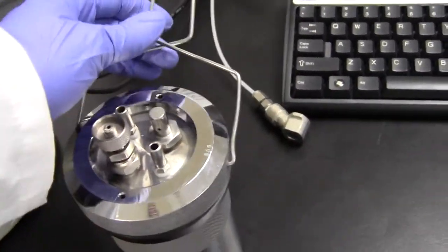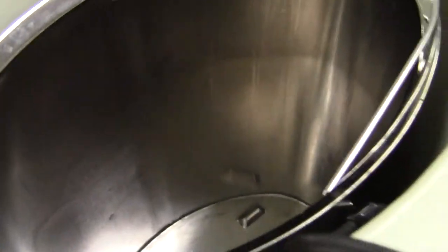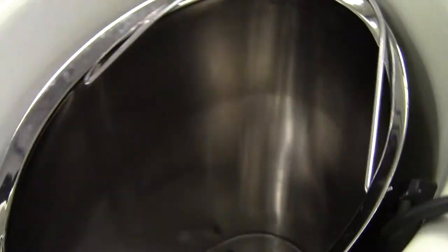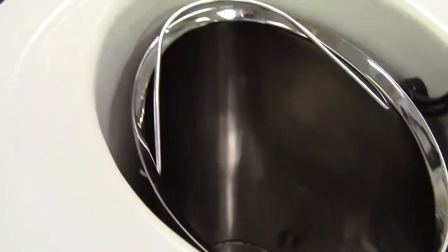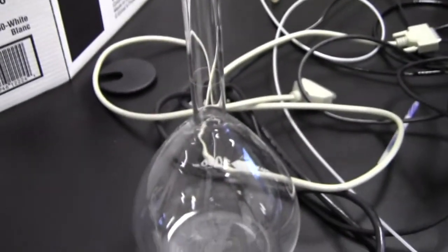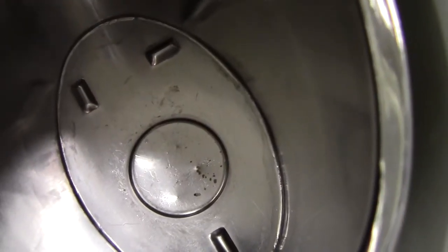The bomb is going to sit inside this bucket, and this bucket should already be filled with exactly two liters of distilled water using your volumetric flask that's provided. If we look inside here, you see the three little bumps at the bottom.